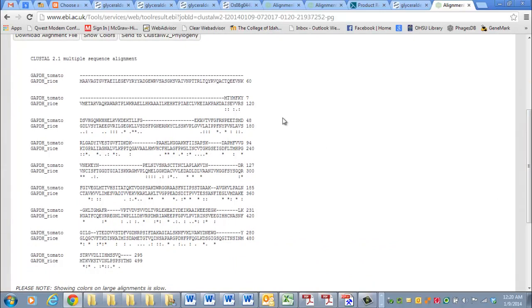Real similar to how you do DNA sequence alignment. But you have to click on that reference sequence link. And then you have to manually put in that little entry that tells Clustal that this is a protein FASTA file rather than a DNA FASTA file. So that's how you do it. Hope it helps.